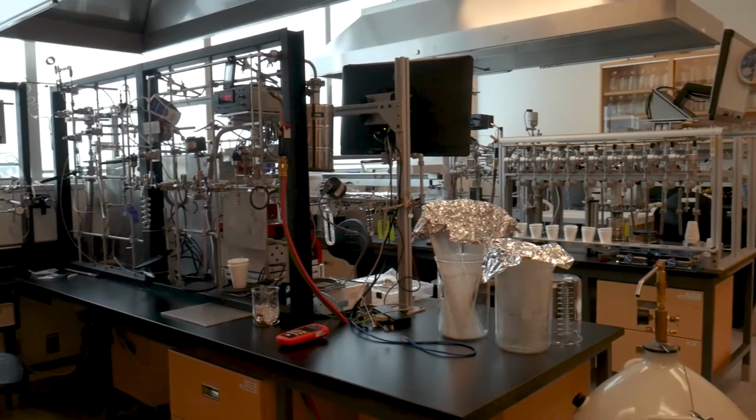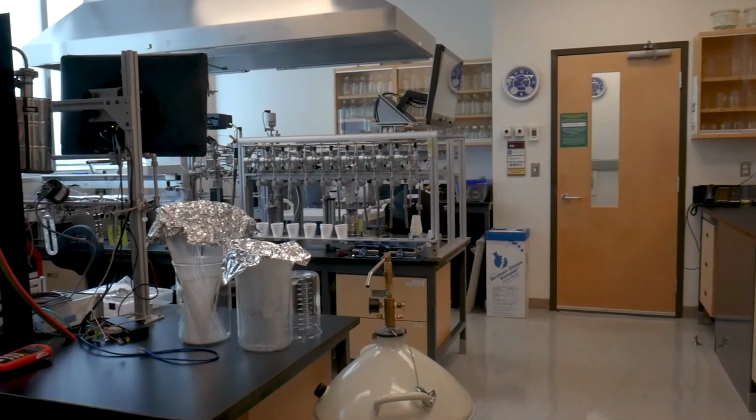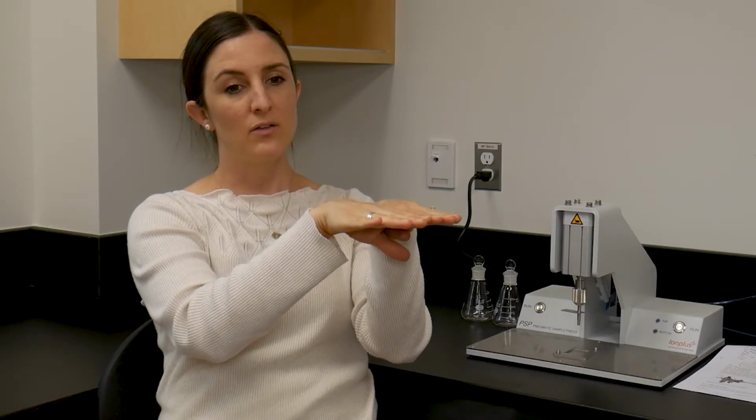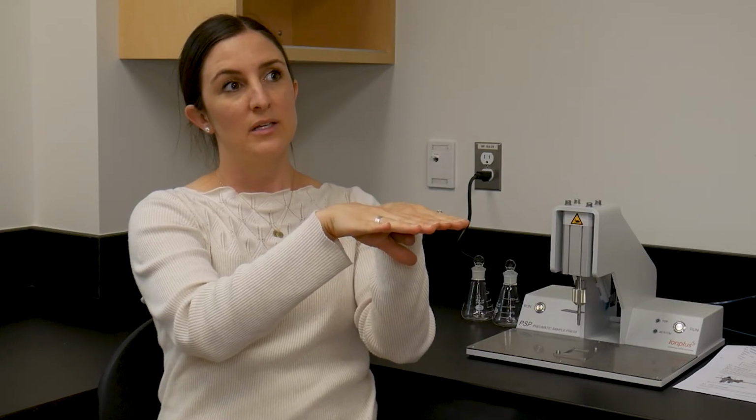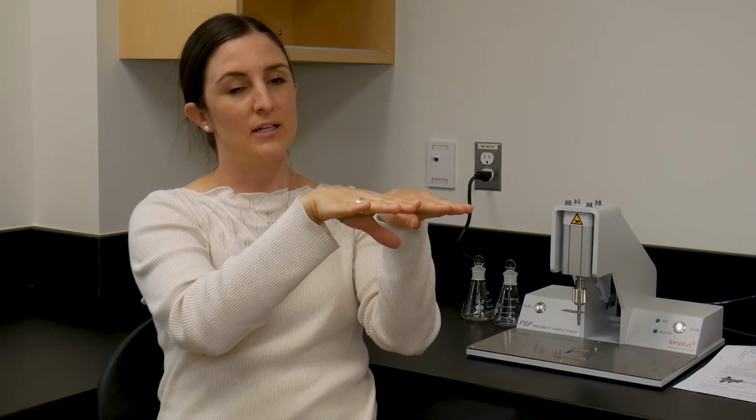When you're living and breathing, and when plants are photosynthesizing, you're incorporating modern CO2 at a certain ratio of carbon 14 to 12. And then when you die, or when a plant dies, the carbon 14, which is an unstable atom, is going to start emitting beta particles and decaying and breaking down. It actually turns back to nitrogen 14. So your ratio that was once in line with the atmosphere starts changing, and you have less and less carbon 14 as something ages. It has a half-life of 5,730 years, which means after 10 half-lives, there's so little carbon 14 left that it puts the limit on radiocarbon dating at 50,000 years.